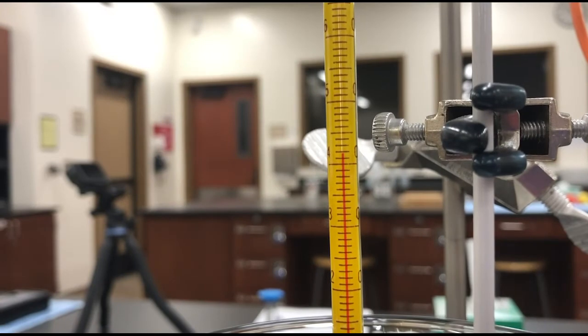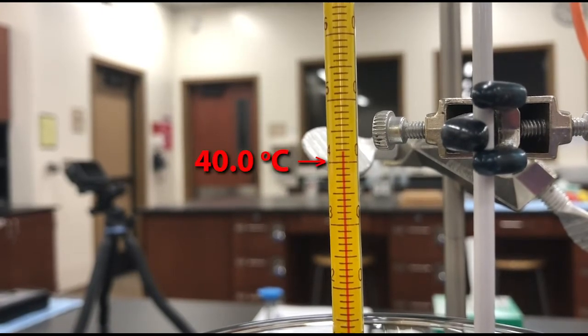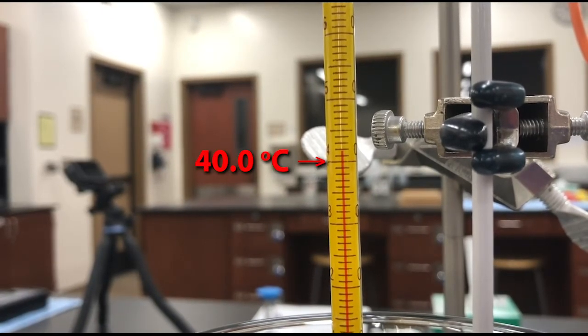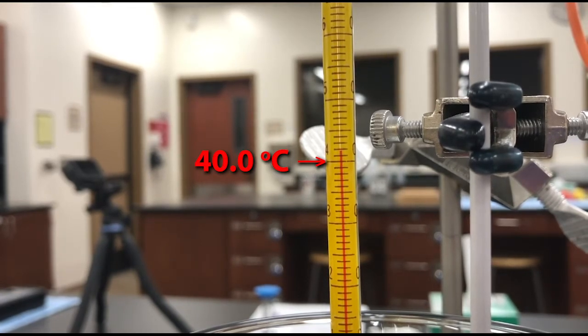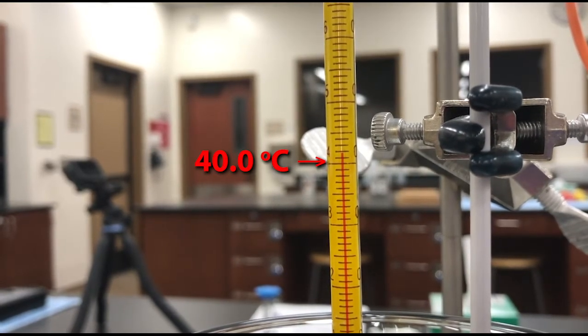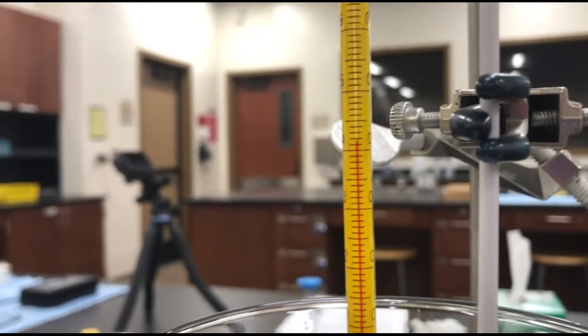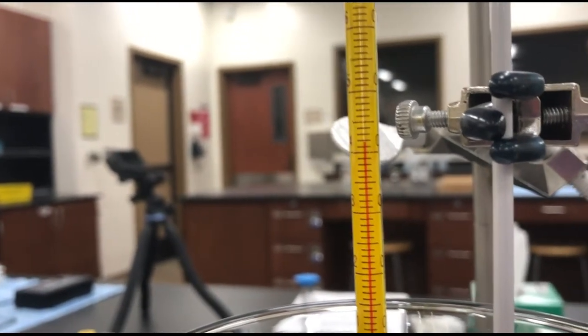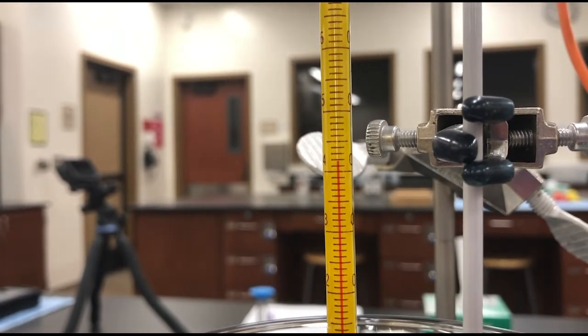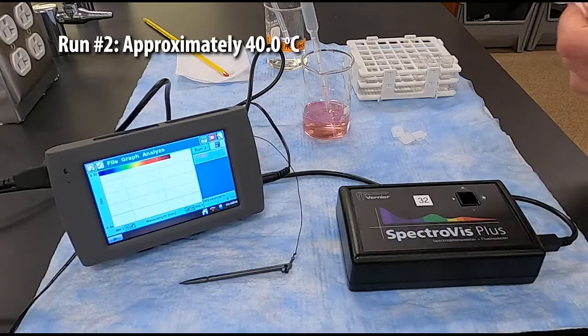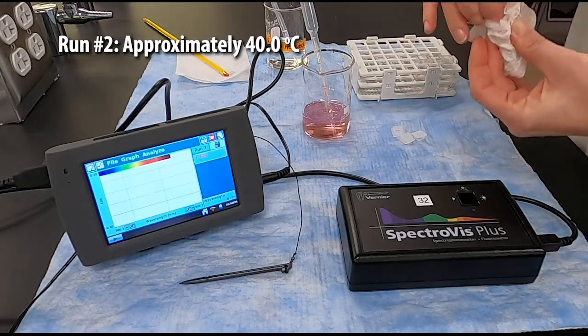Notice that the color of the solution has changed slightly compared to our starting solution. Now we want to record the actual temperature of this water bath. Because this thermometer has the numbers on both sides, it makes it hard to see. The long line indicated with the red arrow is 40 degrees. You can see the actual temperature is slightly higher than that. So you do want to record that in your notebook with the correct number of decimal places.